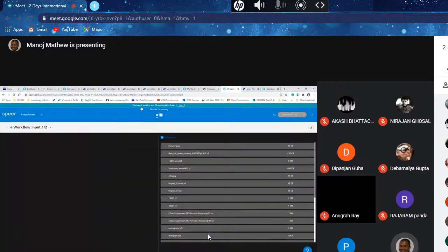4 are pending because the server decided to keep 4 in pending and run only 20 in parallel. And that would change a little bit depending on how many users are on the platform at a given point, what the load is, and so on. So as a free version, there will be small variations. If you really want a fixed or constant number of workflows to run in parallel every time, that might be a paid version that you might need to get. But otherwise, for most applications, this free version is extremely good.